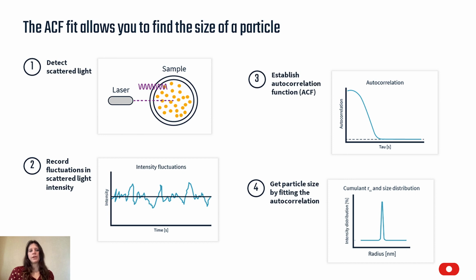They were recorded by our product manager, Leah, and she does a really great job of breaking down where exactly the data derives from and how the ACF is processed to become the parameters you'll need for analysis.